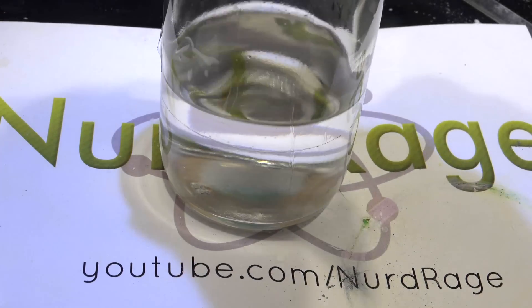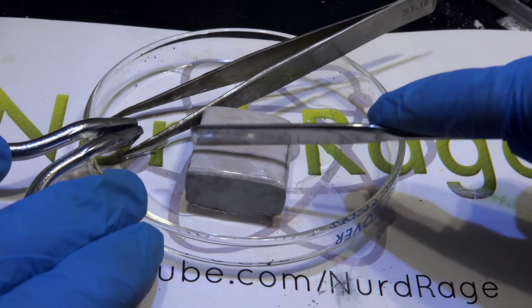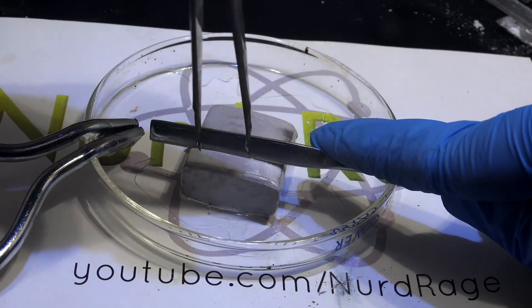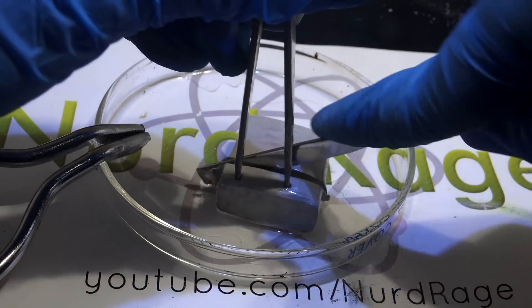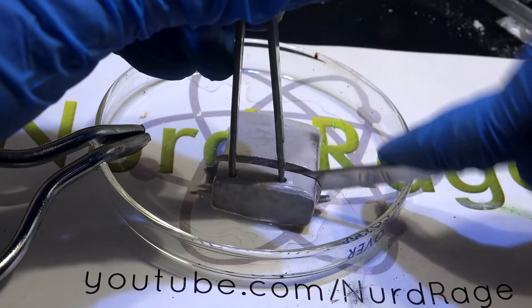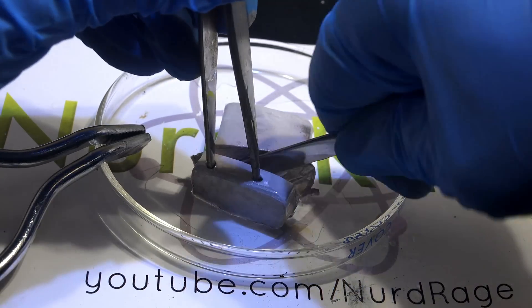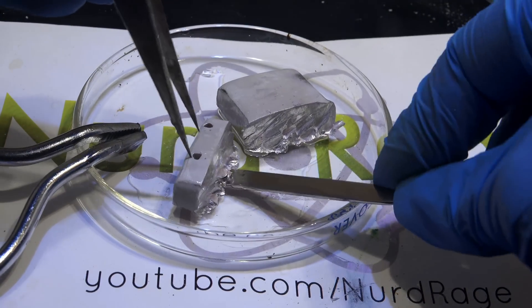Triethylamine is inert to sodium metal, so we're going to use sodium to destroy most of the reactive impurities. Here I am cutting a piece of sodium. For the amount of triethylamine I have, I do not need a piece this big, so I'm cutting a smaller piece to save the rest. It's coated in mineral oil because that's how it was stored. The oil will contaminate our triethylamine at first, but we'll be removing it anyway by distillation.